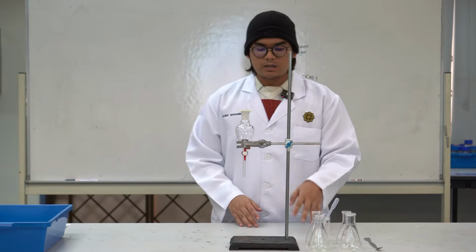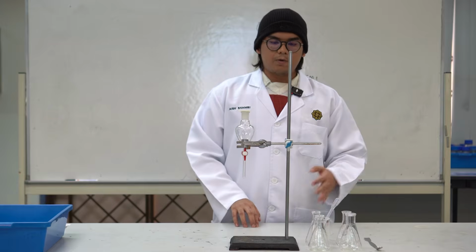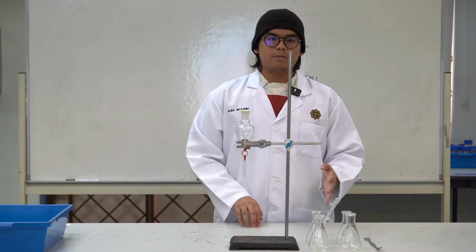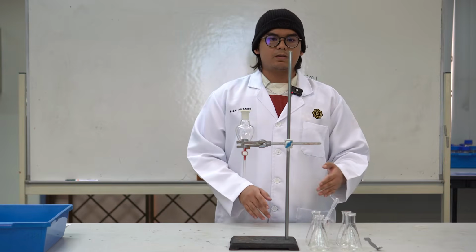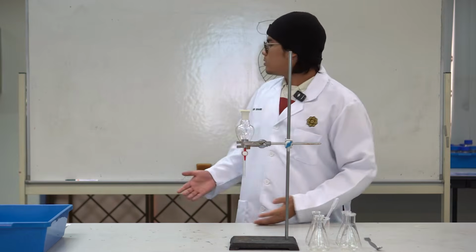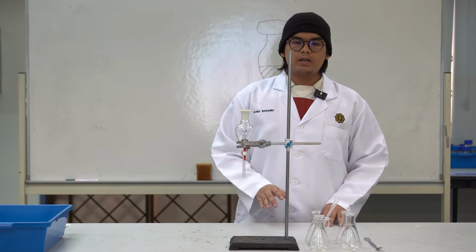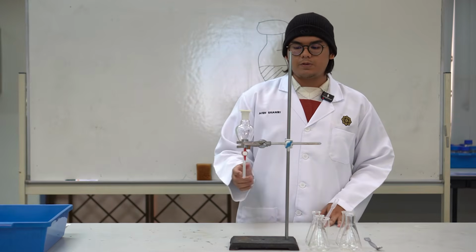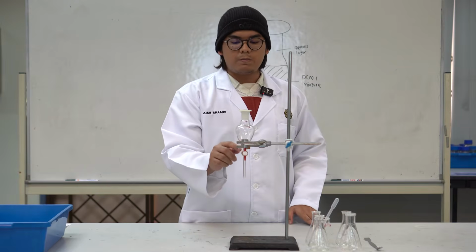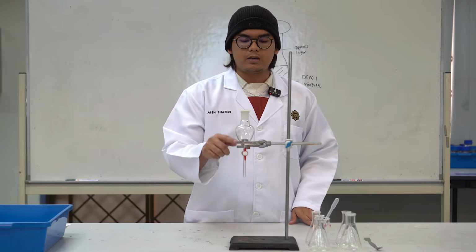In this experiment we will be handling organic solvent that evaporates easily and quickly, so we need to handle the chemical properly by using a fume hood. And the last one is checking our apparatus in case it's faulty, especially the separation funnel, because the stopcock may be leaking, so we need to check before we handle the chemical.